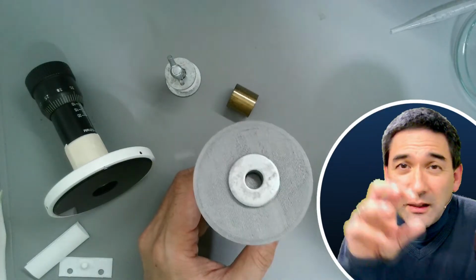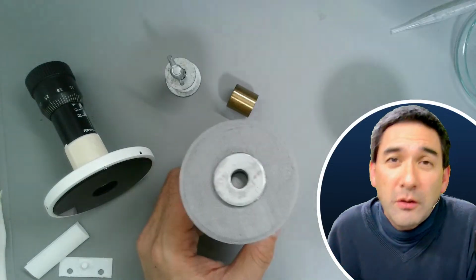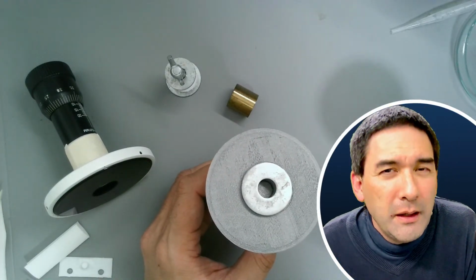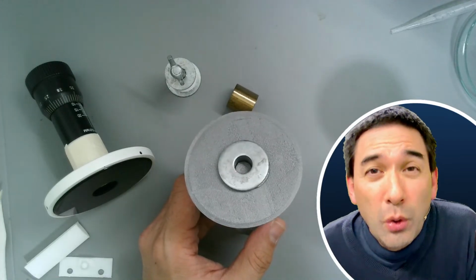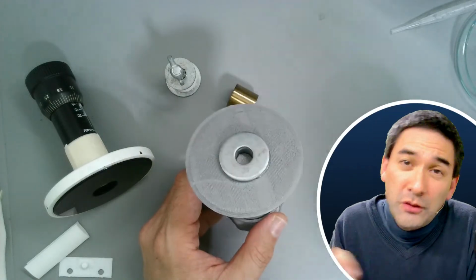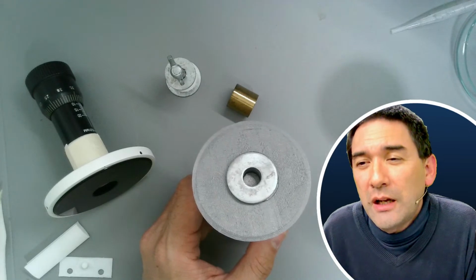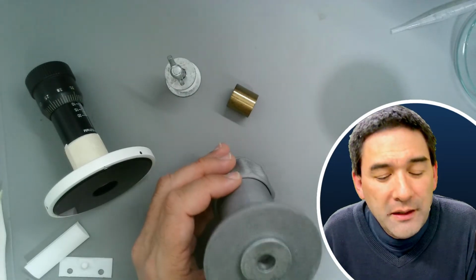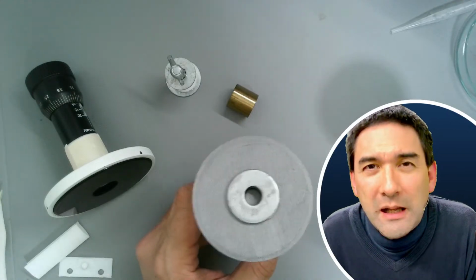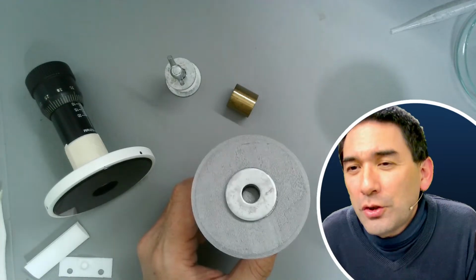Like the arrangement of cells, maybe, or any specific things to look for. That would be very educational if there were some kind of documentation. I've even once proposed maybe putting a QR code on the slide, and then when you take a picture of the QR code, you're connected to a website where you get more information. I mean, that would actually be a very good idea. So this is something where I generally feel that readily prepared microscope slides need a little bit of documentation, right?